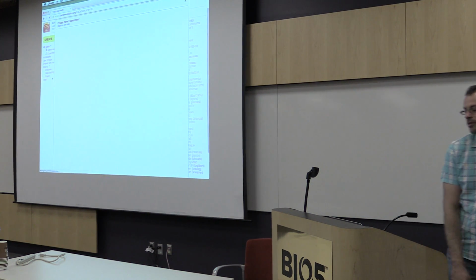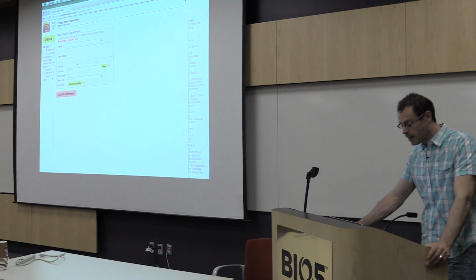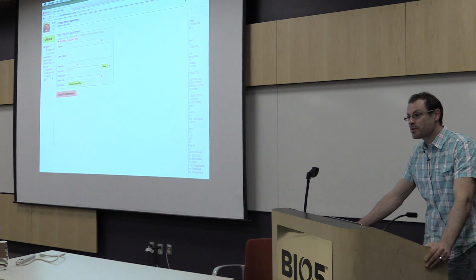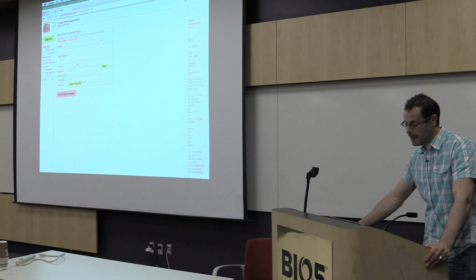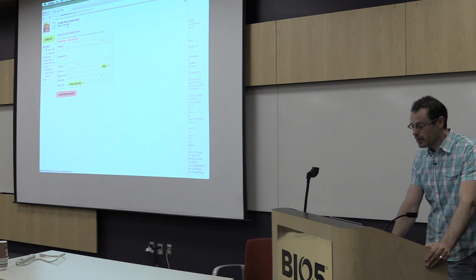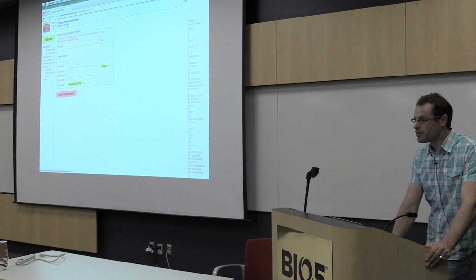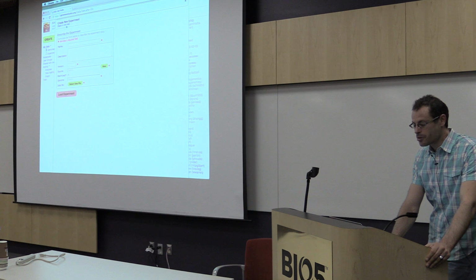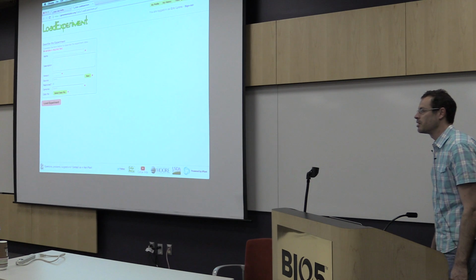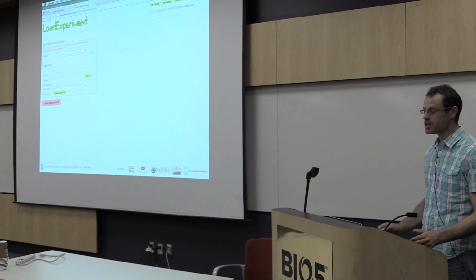All of these functional diversity data we consider to be an experiment. So what we're going to do is go get some example data and map it to this genome. I'm going to show you where to get these example data from. What it's done right here is open this up inside of your user profile page, but we can just say open up in a new tab, and it's going to take you to the parent tool that does this, which we call load experiment.